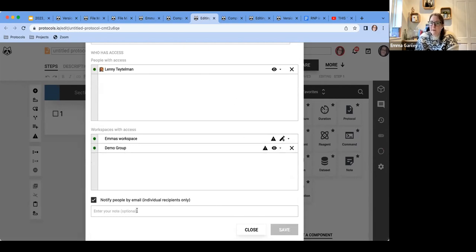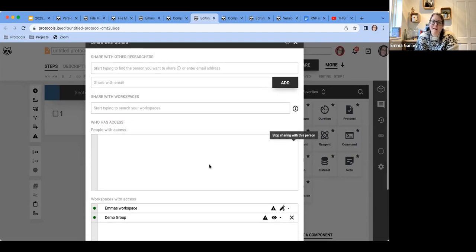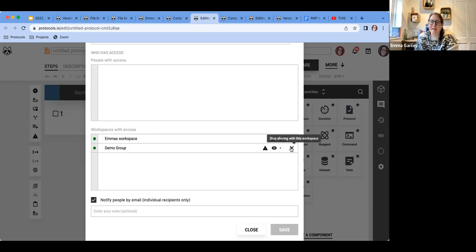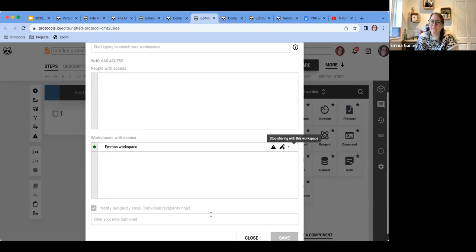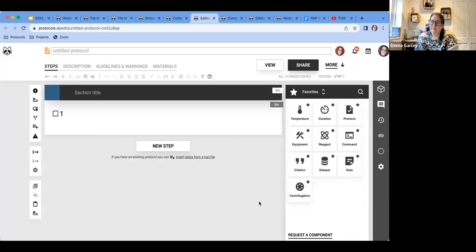You can notify by email. So Lenny will have got an annoying email from me now telling him that I've just shared this with him. I'm going to take it off again now. So he'll be even more annoyed when he clicks it and it goes nowhere, but I can take them off in the same way. So there are lots of different ways to share with other users that way.